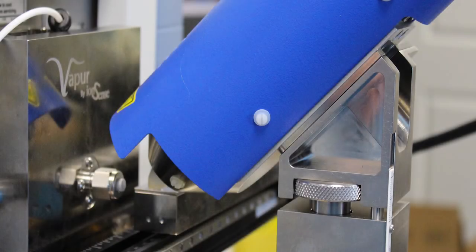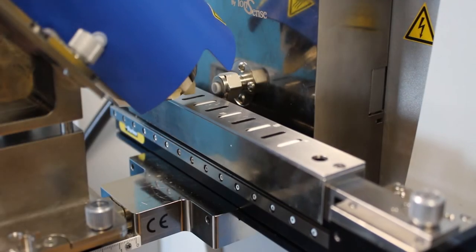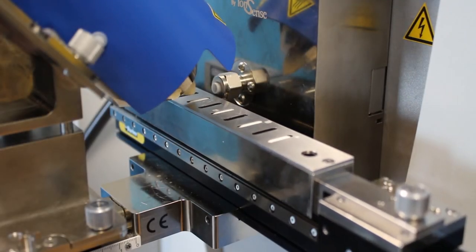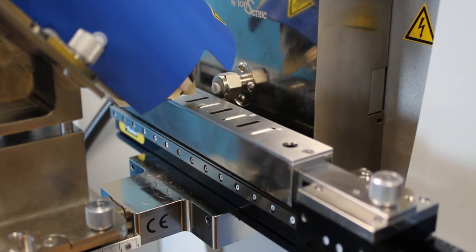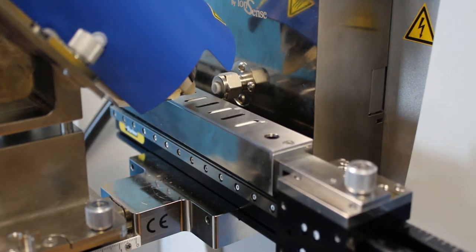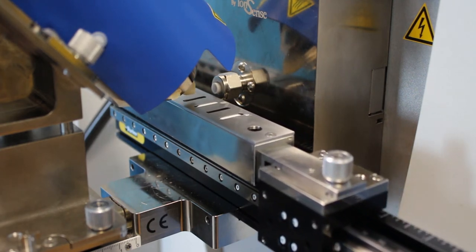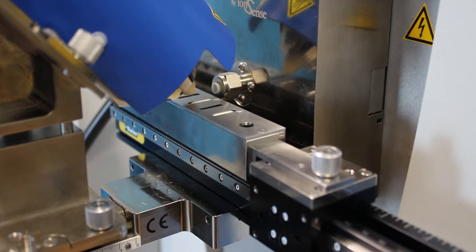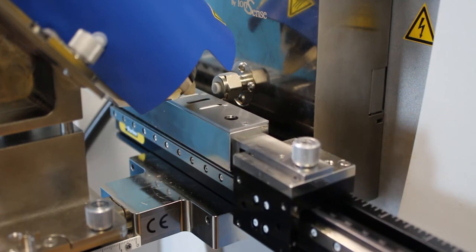For optimal results with this method of sample introduction, the DART source should be positioned at a 45 degree angle facing down towards the surface of the tablets as they pass through the DART-MS inlet, made possible using our DART-SVP 45A configuration package.